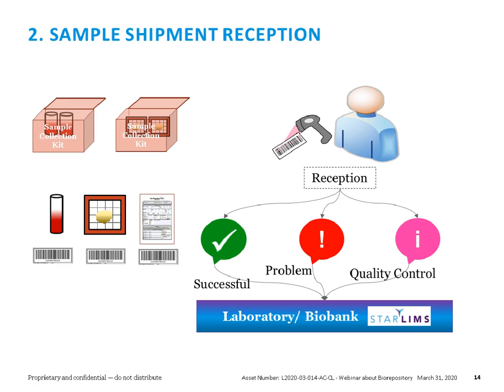But we can also get some problem samples in this reception, right? And the LIMS should also provide a solution for handling those problem samples, like perhaps this kit we don't know, or we have no idea about this shipment, and allow you to handle those later on. It shouldn't stop you from just continuing to scan and receive the majority of your samples that should be good to be received in the LIMS. So we also need to have these options for handling problem samples.